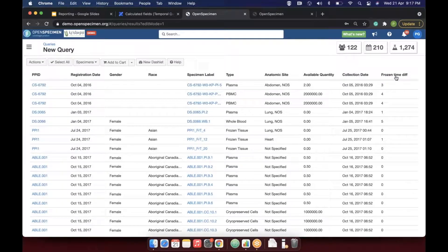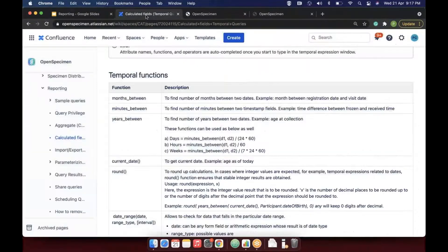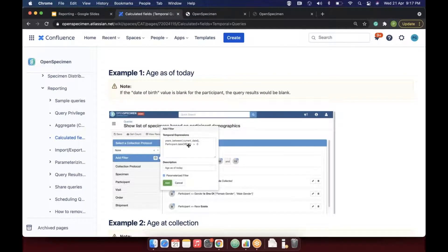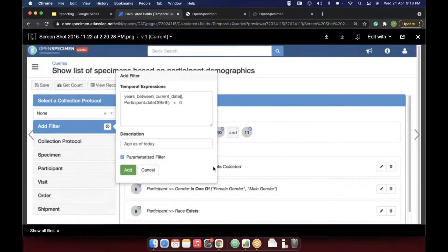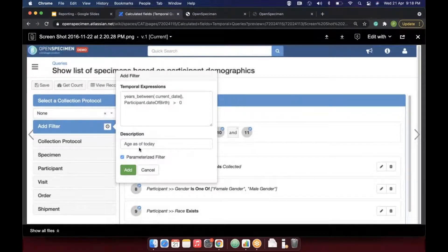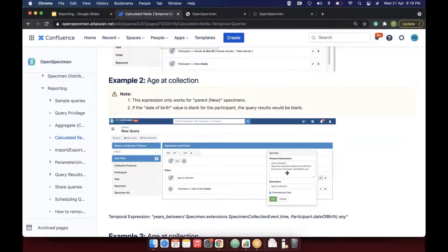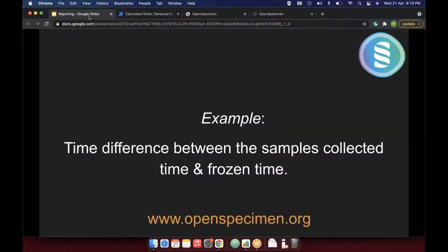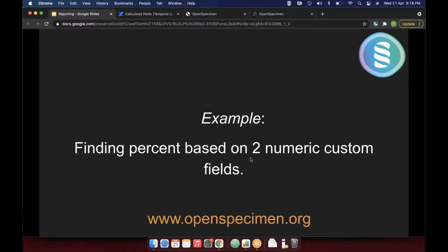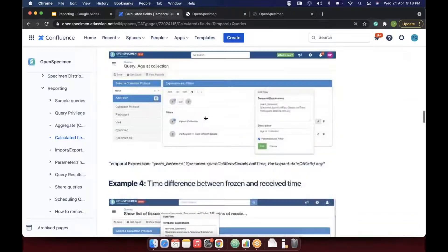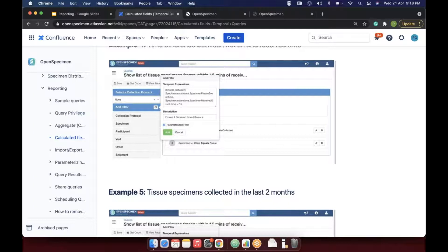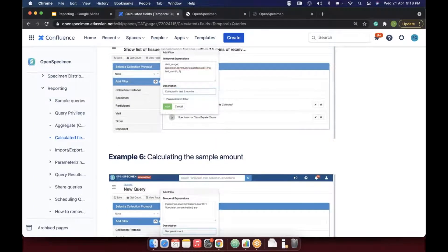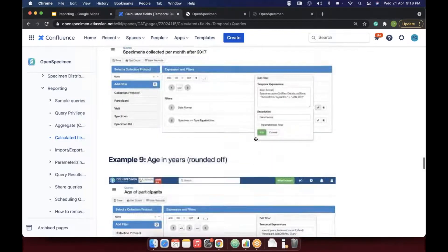For age calculations, you can use 'years between current date and participant date of birth' to get age as of today, or 'years between specimen collection date and date of birth' to get age at time of collection. The query module user manual at help.openspecimen.org has many examples for calculated fields and temporal expressions, with functions like months between, minutes between, and years between.